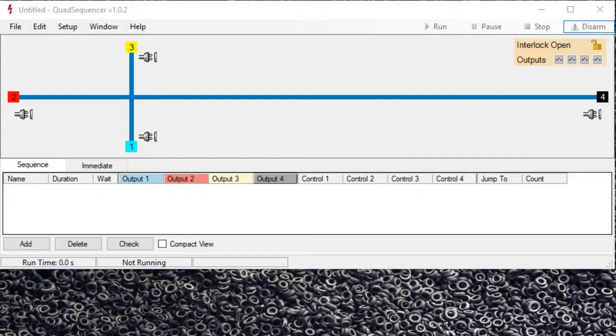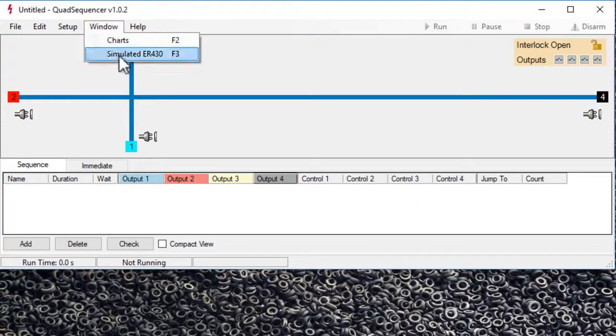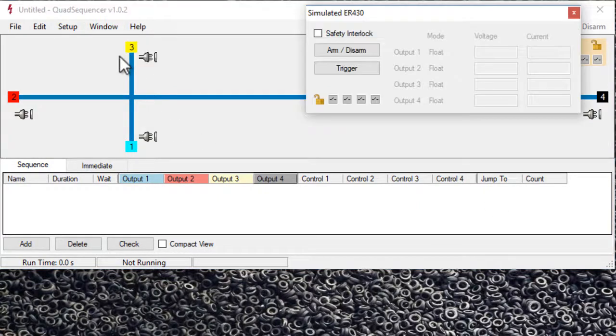You can access it from the Windows menu and click simulated. Here is the screen here.